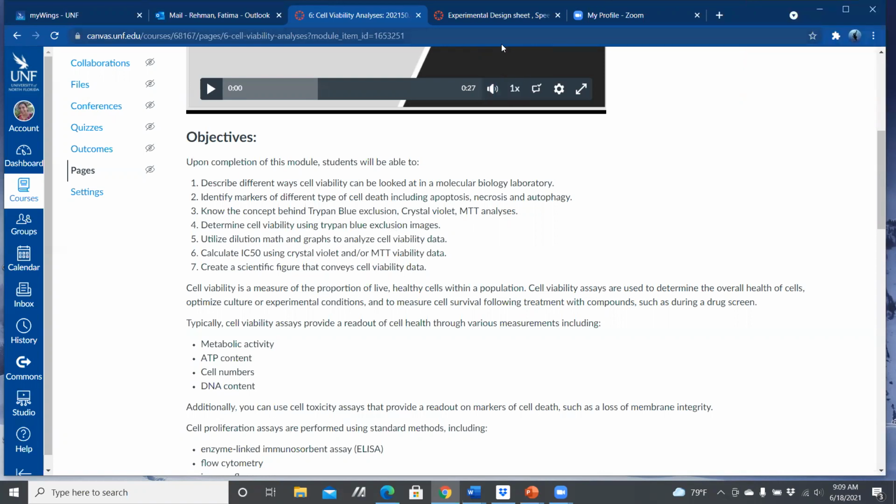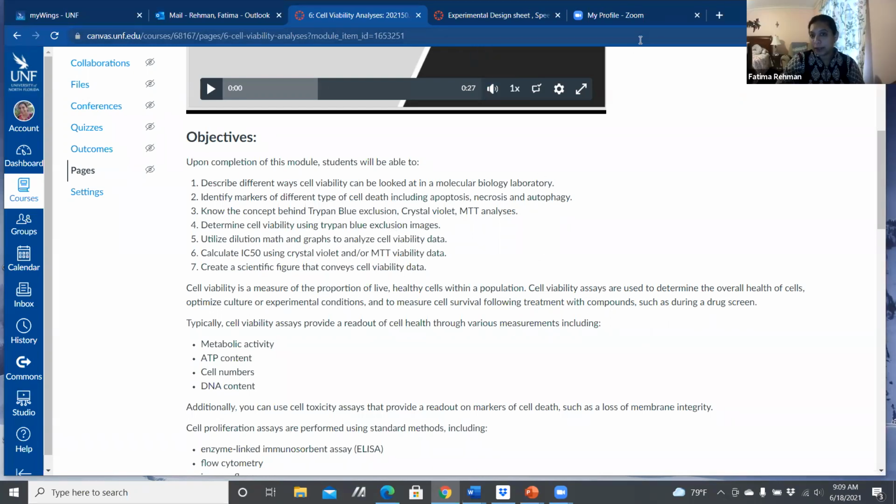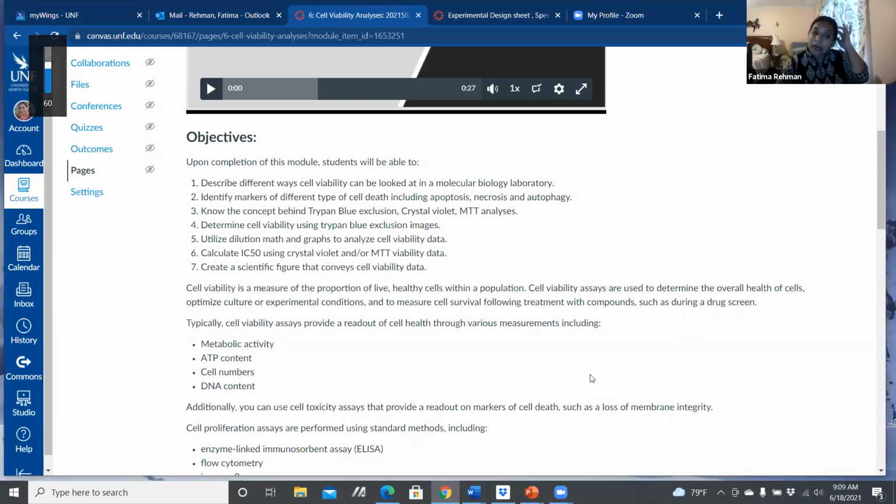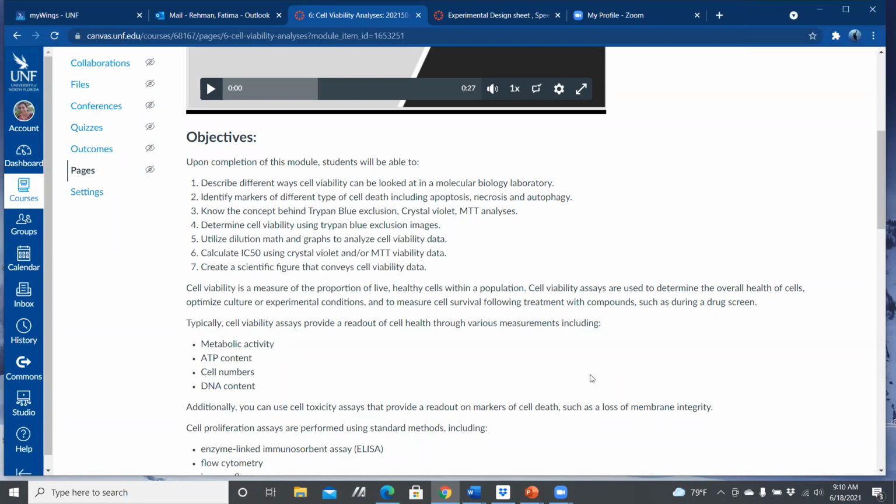Clear. Clear. Why not the blue ones? The blue ones didn't have the ability to not let the dye in the cell. So the blue ones are the ones that are letting the dye in, which indicates what? Their cell membrane is permeable.